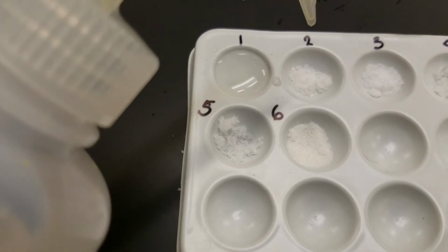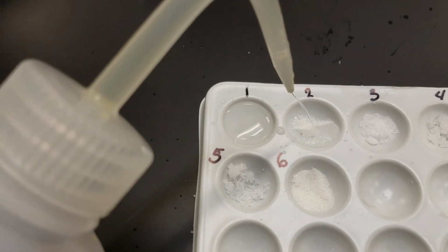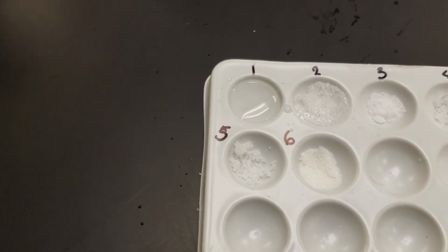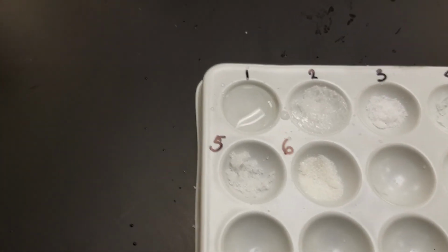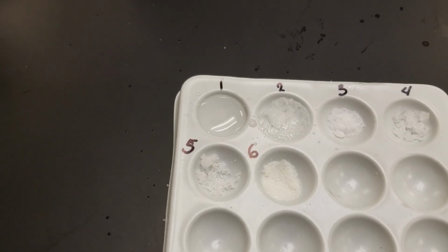Phenyl salicylate, number 2. No dissolving at all. It absorbs some of the water and it just kind of sits there. Doesn't do anything. So no solubility for number 2.